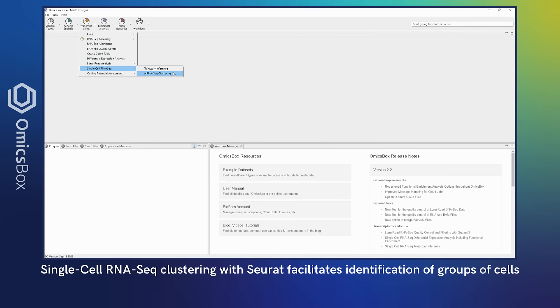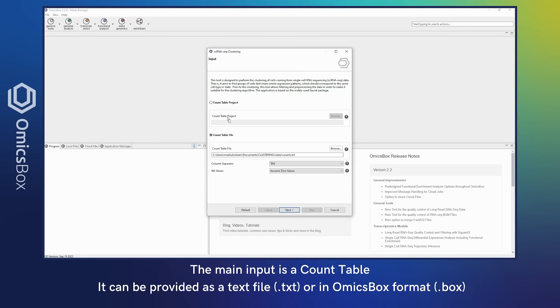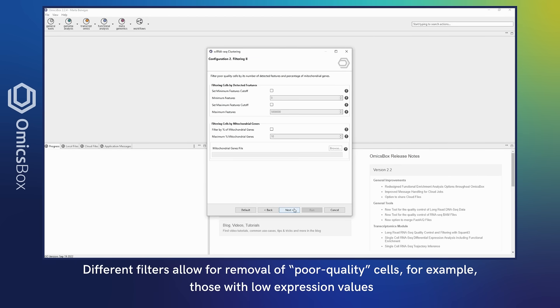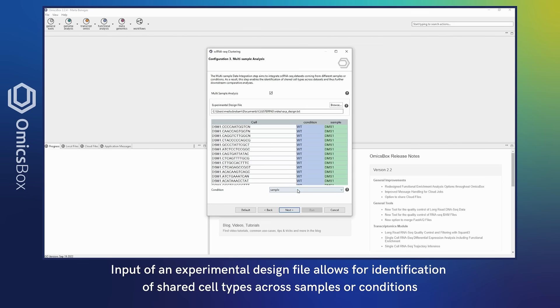The main output is a count table. It can be provided as a text file or an OmicsBox format. Different filters allow for removal of poor quality cells, for example those with low expression values. Input of an experimental design file allows for identification of shared cell types across samples or conditions.